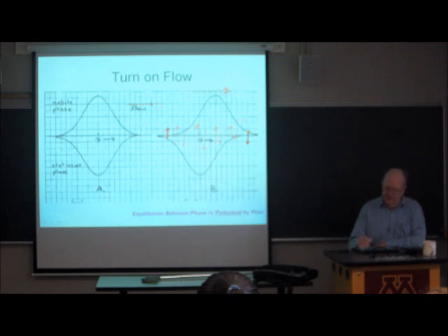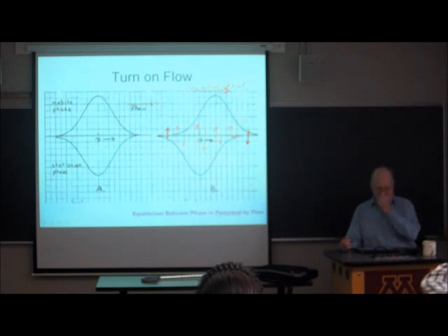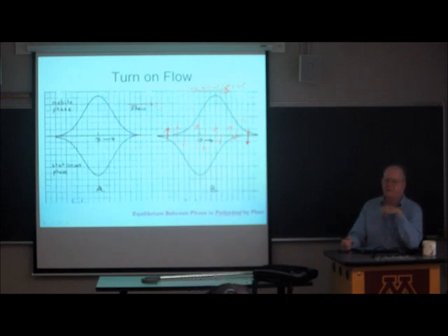We can call this longitudinal or axial, and we can call the perpendicular to that the transverse or radial. So you want the rate of movement radially to be fast compared to the rate of movement axially.